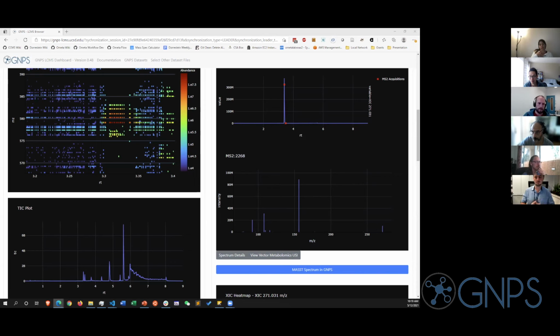Or if you're interested in natural products and you want to look at geographic distribution, that is one way to find out, because the metadata that is reported is ReDU based, which also provides geography if that's provided. And so there's lots of places that this can be really nicely used and can help you advance your science quite a bit.